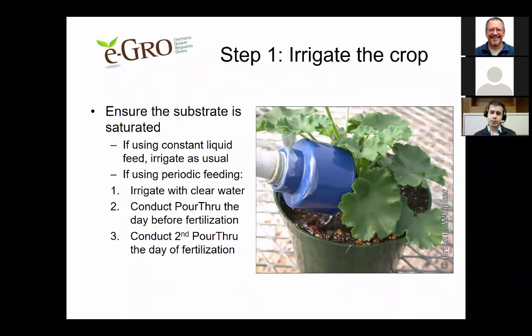Next, I'll talk through the steps of how to conduct the pour-through method. First, you're going to want to irrigate the crop and ensure that the substrate is extremely well saturated. If you use a constant liquid feed fertilization regimen, irrigate as usual with your fertilized irrigation water. However, if you're using periodic feeding — for instance, fertilizing once a week — irrigate with clear water and conduct a pour-through the day prior to fertilization. Then conduct a second pour-through the day of fertilization to see the differences between unfertilized and freshly fertilized plants.